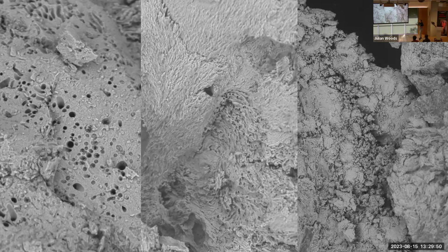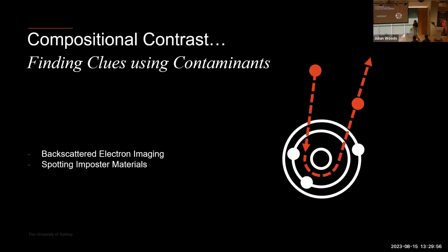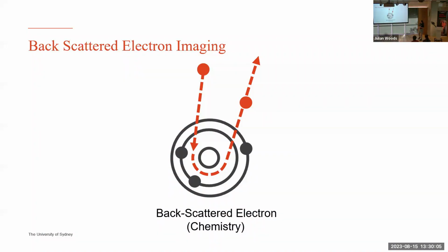Now, this is all done with secondary electron scanning microscopy, but sometimes just looking at the surface doesn't cut it. We have to get deeper and we have to look at maybe the differences in what an artifact's made of. The way we do this is using backscattered electron imaging. It's a different mode of interaction with the electrons that we shoot at the sample surface. And in this interaction, the electrons that come down see the atom. The atom says, no way, Jose, you are not knocking out one of my electrons today. And then the electron goes, okay, Uno reverse, heads back to the detector. And so we detect the exact same electron that we've sent into the sample.